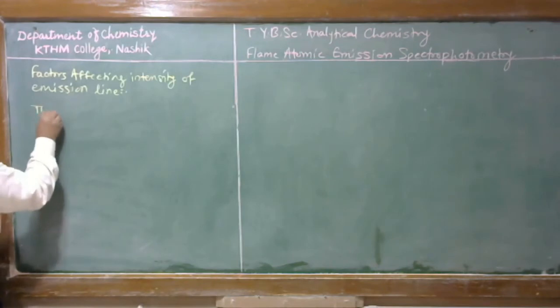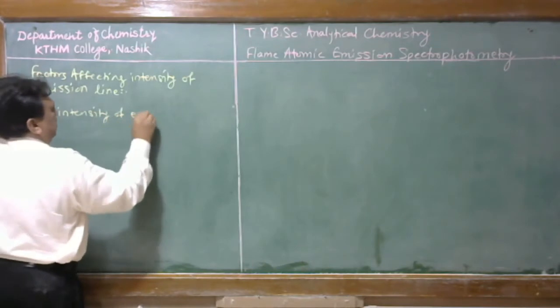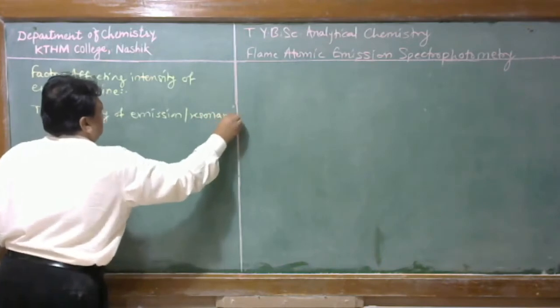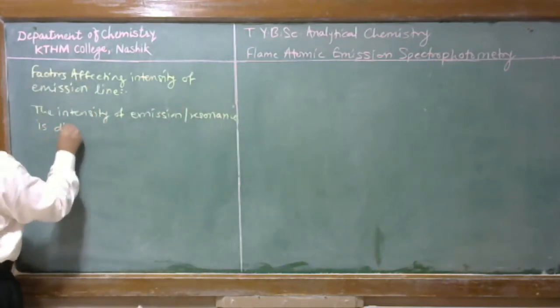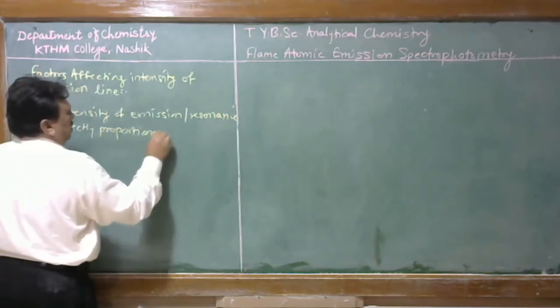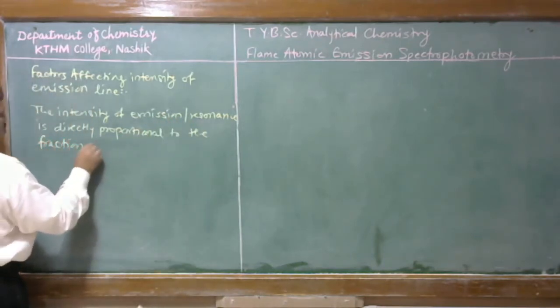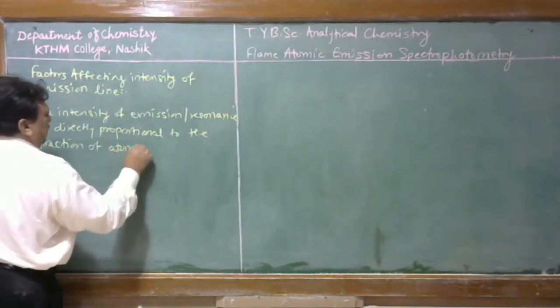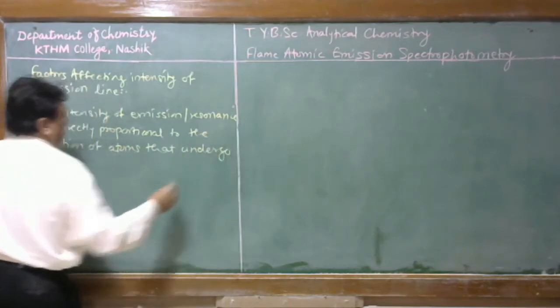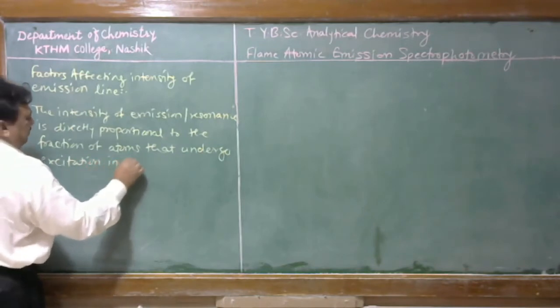Therefore, the intensity of emission or resonance line is directly proportional to the fraction of atoms that undergo excitation in the flame.